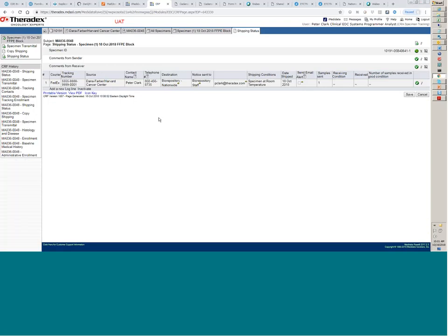And now, basically, this particular patient, which was the step 1 registration, we've gone through the process of submitting the specimens for analysis. You're going to follow the same process when the patient is eligible and live in the study. So the process remains the same. This particular patient, we were just doing this to determine the eligibility. So any quick questions before we finish this training?